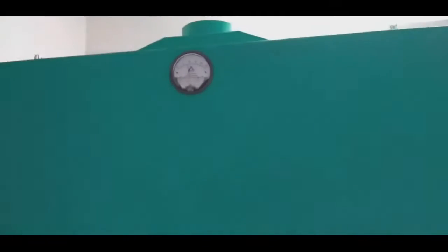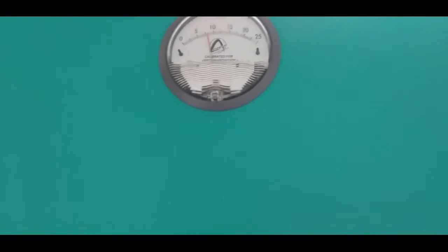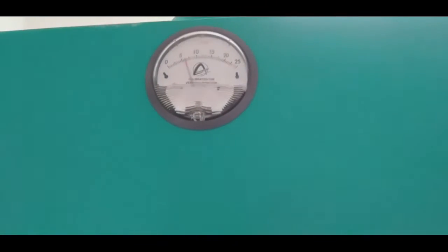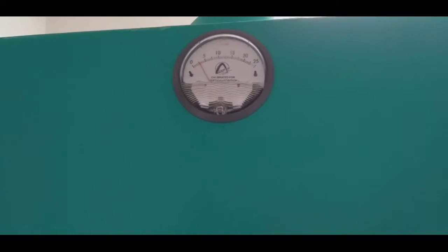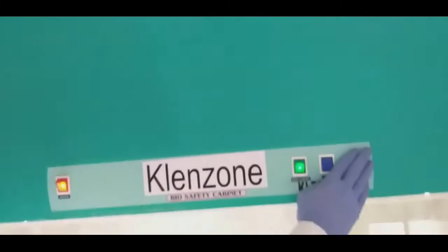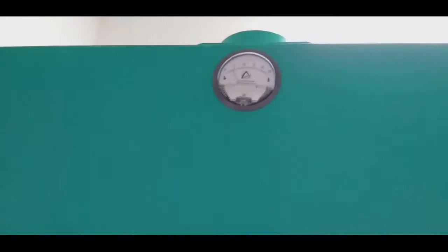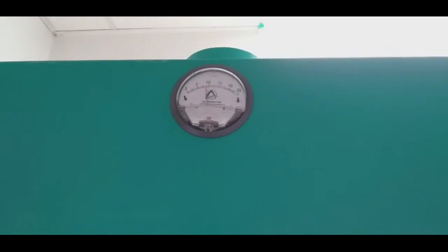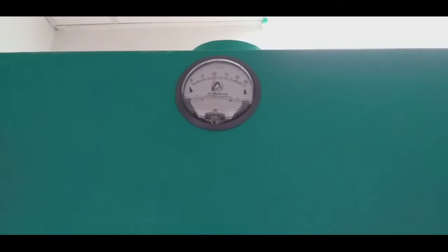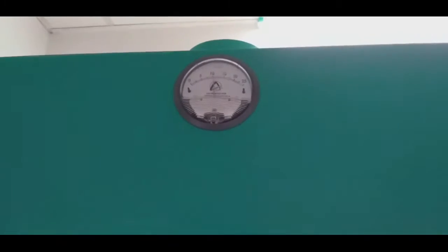It has a pressure box which indicates the pressure. This pressure indicates whether the compressed air entering inside is at the required pressure to generate positive pressure and carry out the filtration process of air smoothly. When you switch on the blower, you will see the knob inside the pressure gauge go up. When it reaches near unit 10, that means the appropriate pressure of air is achieved inside and the filters are working properly.